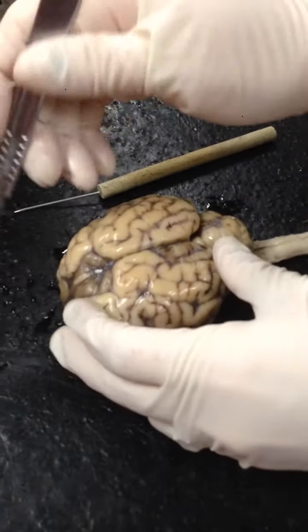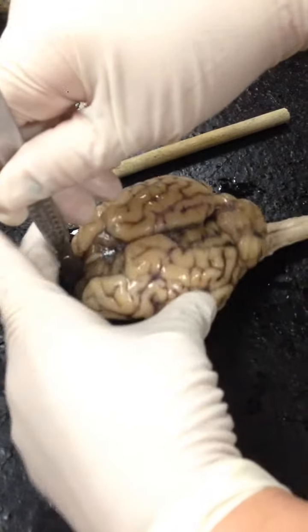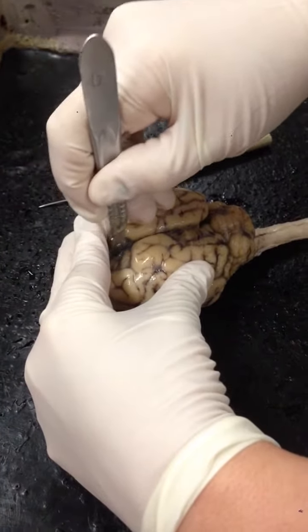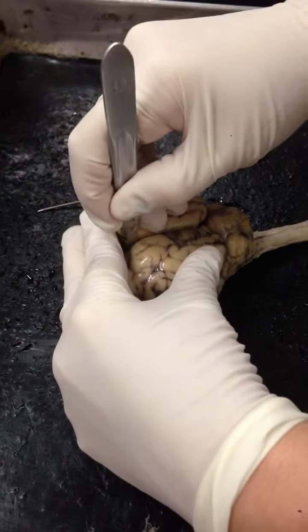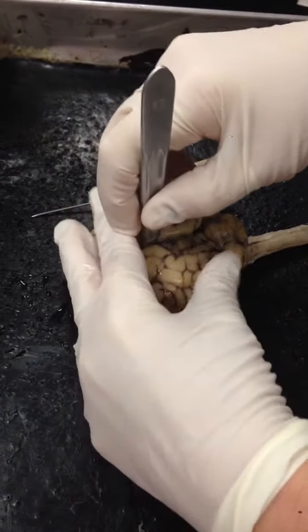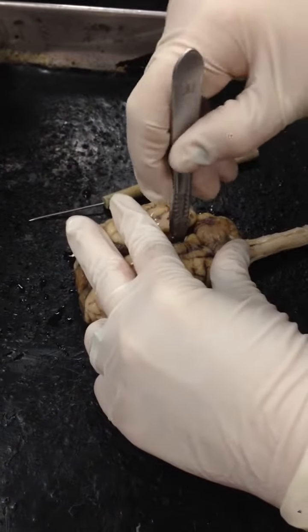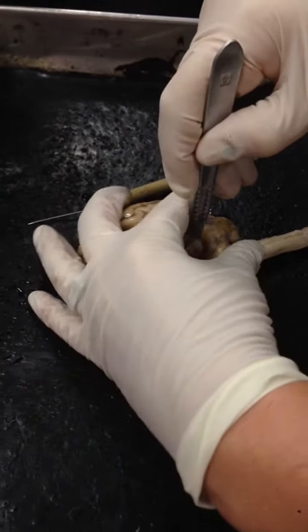Okay? Alright, I'm going to cut it down. So where am I cutting on the brain? Okay, just making sure you guys are paying attention to me. Not a one laugh. Okay, you guys are way too serious. Maybe you should go into film.